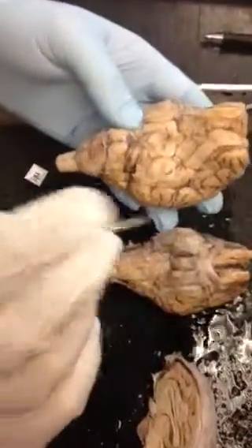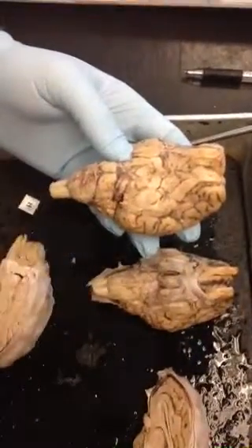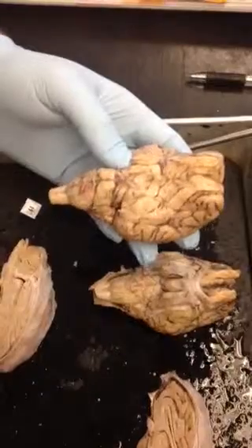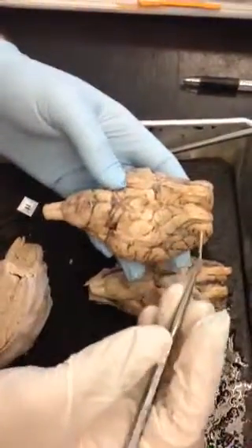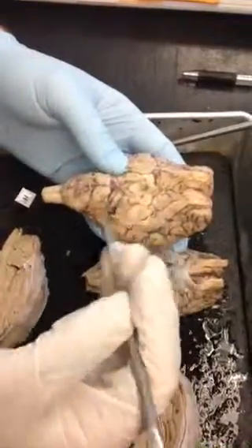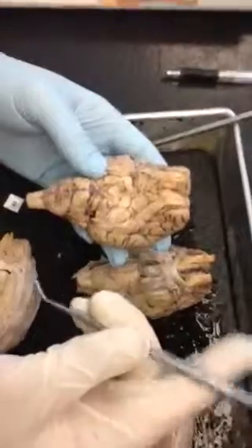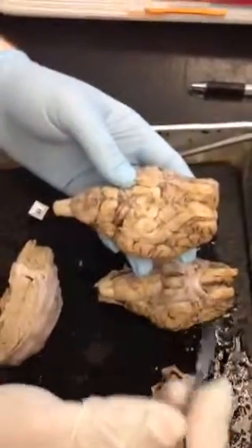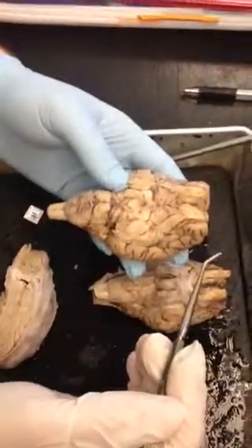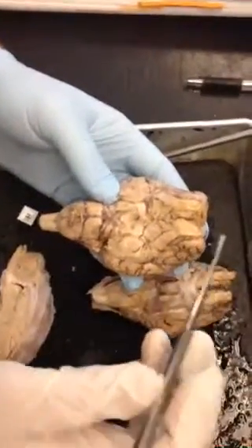And then the cranial nerves. Remember, you need to be able to identify the first 6, but know the names and functions of the first 12, right? She told us we just had to know the first 6. Oh, then don't worry about it. But you definitely need to be able to identify the first 6 for sure.